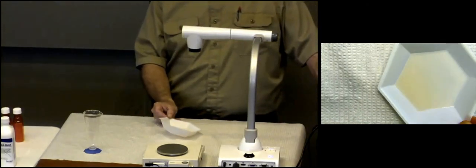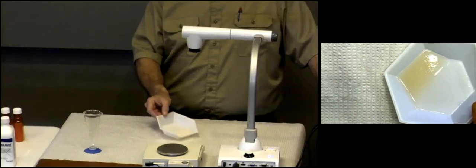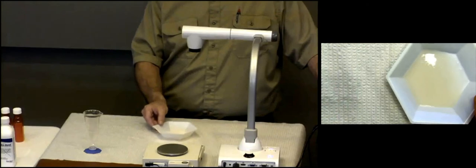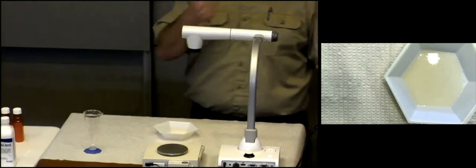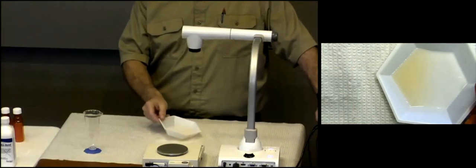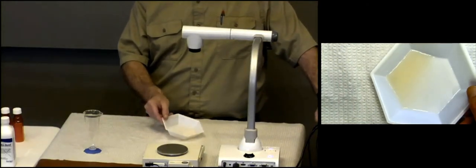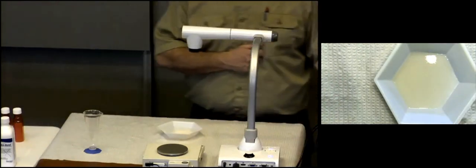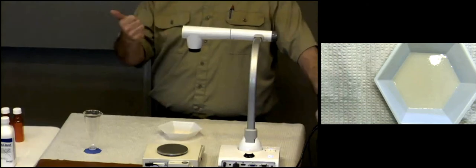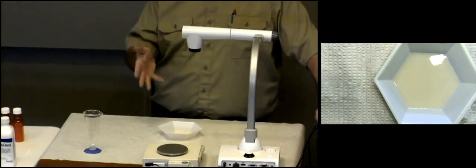Is that clear? So how would you describe it? Opaque. I like opaque or cloudy. I could live with either of those, but opaque's a good word. So we have off-white, fruity smelling, opaque, viscous. Okay, and now not highly viscous, but this is thicker than water, so we're going to call it viscous because of the suspending agent in there. Suspension. We're still not quite done. So off-white, fruity smelling, opaque, viscous suspension.